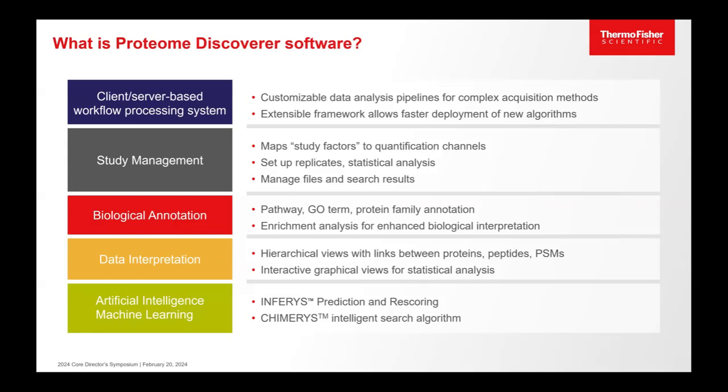So it's really expanded dramatically over the 15 years that it's been out. Partway through the Proteome Discoverer process, around PD 2.0, we added the study management feature as customers' data sets got larger and larger, keeping track of all the data files, assigning meaning to those data files. So this data file is a disease sample, this other data file is a control. And especially when we're thinking about TMT quantification, where we have multiplex quantification, mapping a quant channel to a study factor is even more important.